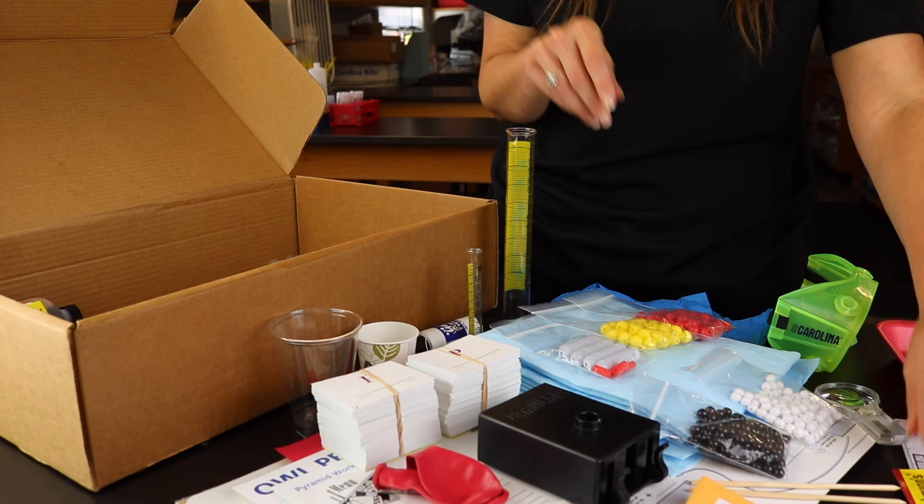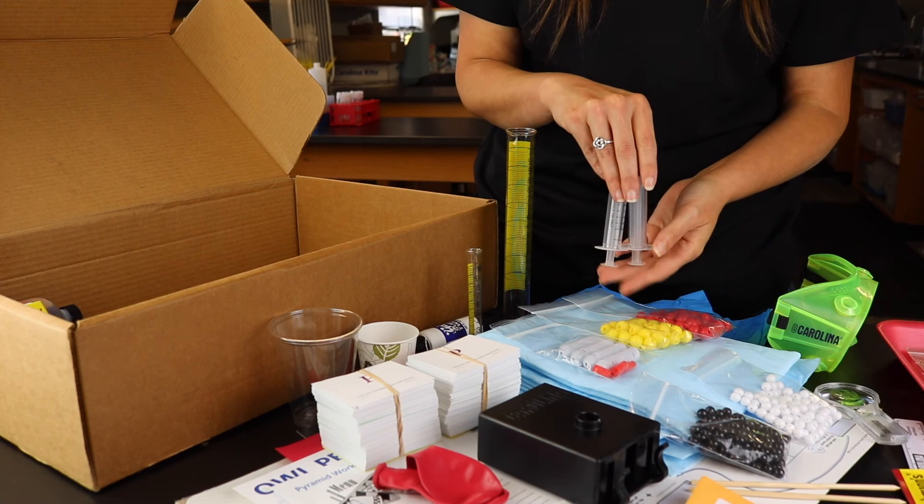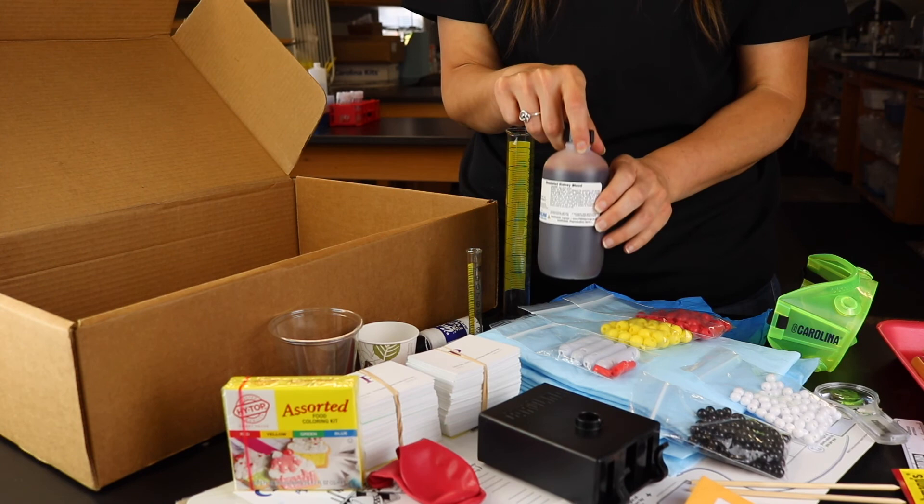The Carolina Kits 3D Flex program can be your standalone lab program or aligned to most major textbooks to provide the hands-on lab portion for courses in your district. To learn more about how teachers in your school district can provide remote or in-class socially distant lab instruction, email our product specialist at product@carolina.com.